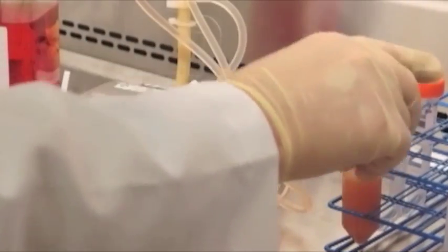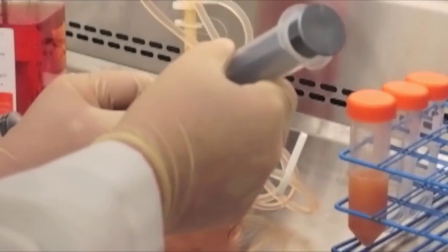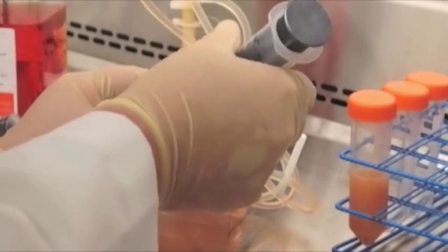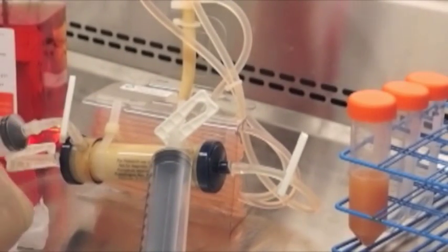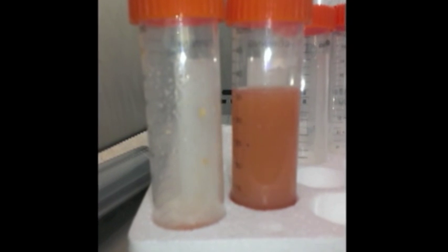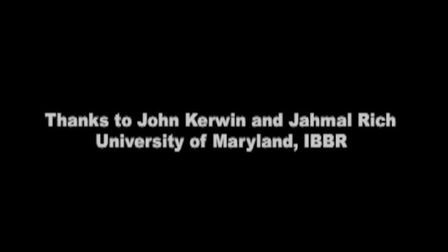A hollow fiber bioreactor can be the simplest way to generate large numbers of cells in a very small volume and to harvest them simply and without using any proteolytic or dissociation enzymes.